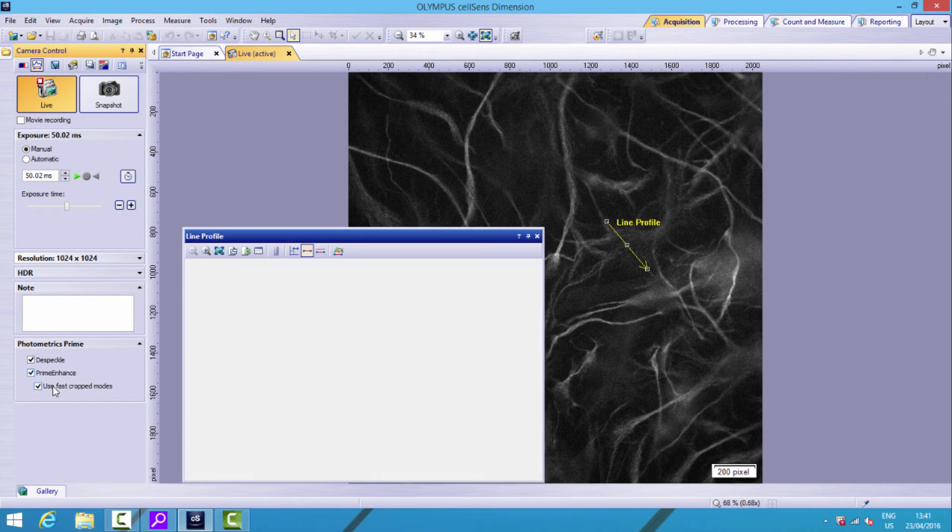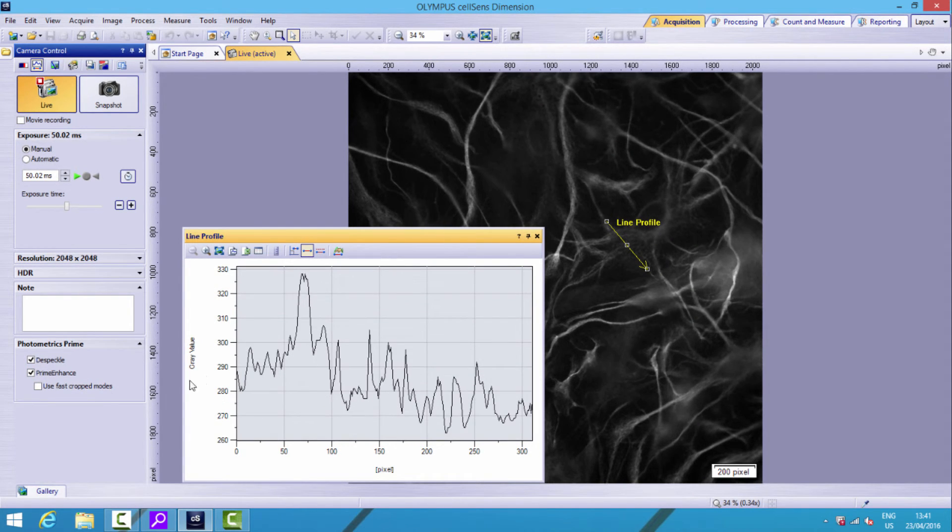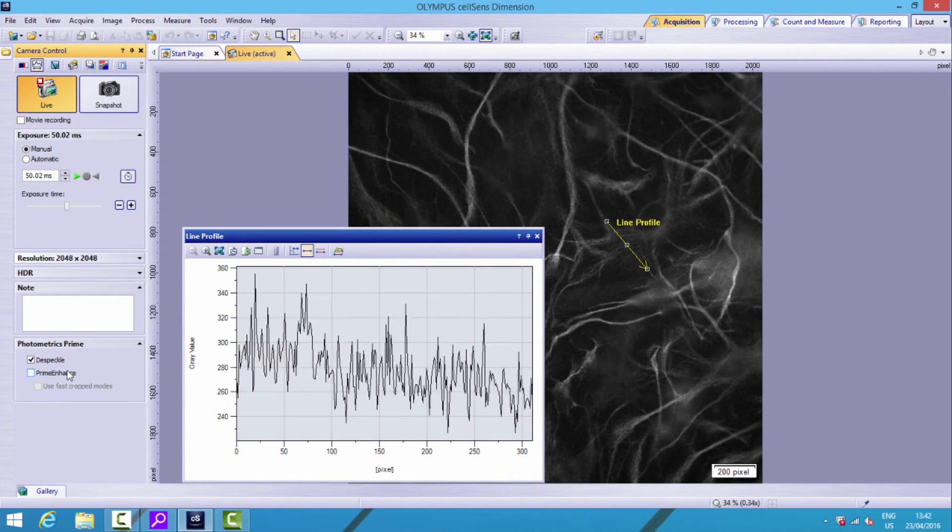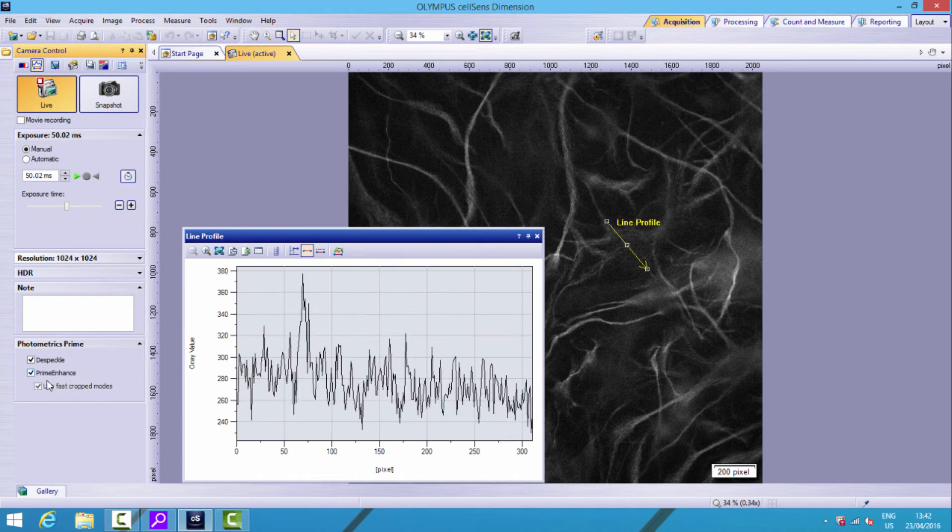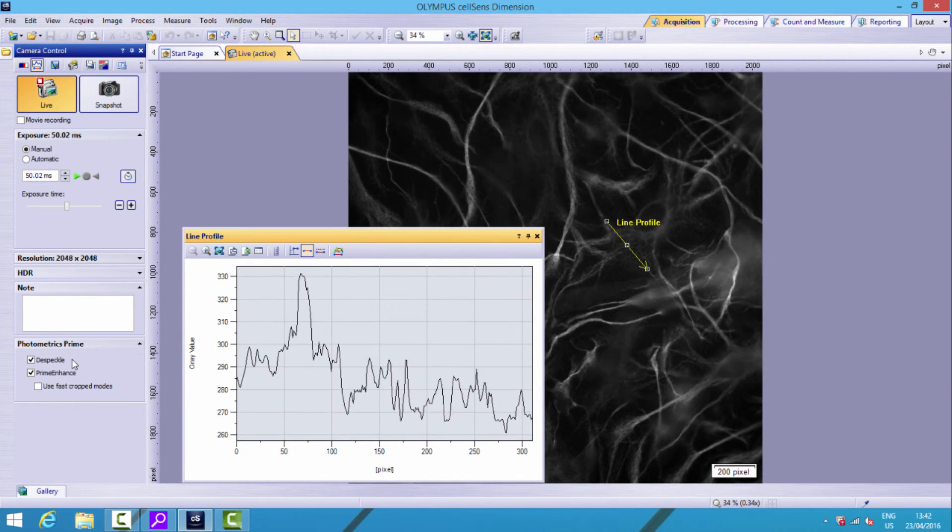And let's just go down here and we'll see the enhance. We'll take it off the fast mode, and now we can instantly see the image much, much calmer, much less noise in it. That's what you get with everyone else. That's the same. You can turn it off if you want, and this is when it's on. Again, let's just ping it back to it and we can see much greater control.